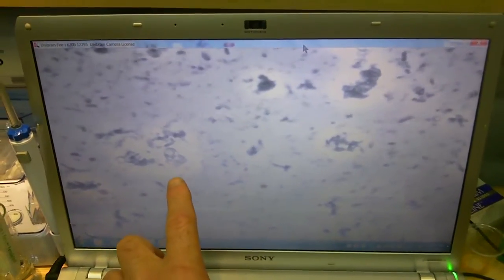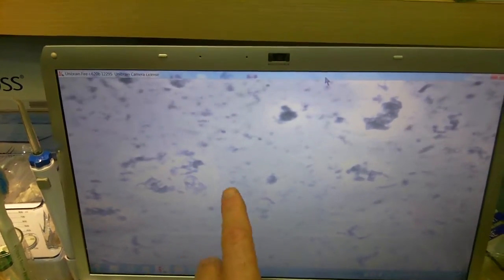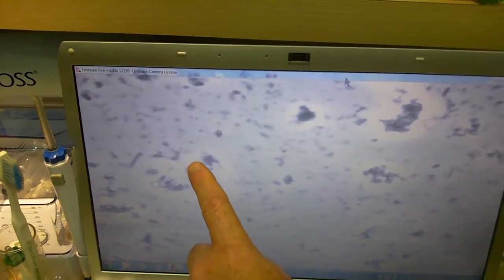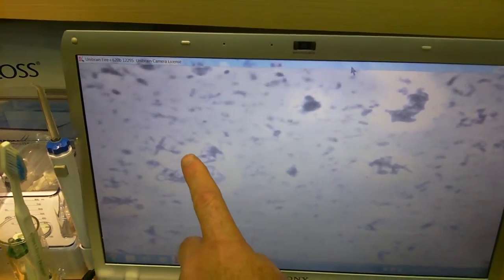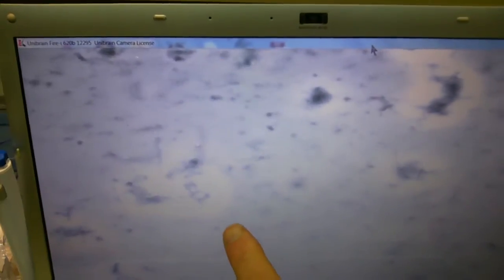How old are you? Twenty-six. Twenty-six is about the age when people really start getting their periodontal infection in full gear. This right here is a spirochete — you can see it. They eat like a shark; they bite onto their food and wiggle their body to rip pieces off. And this is some food from this morning that you've eaten, as well as bacteria. These pieces are food, and this is quite a revealing slide.